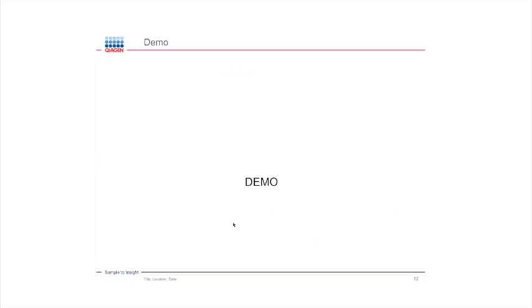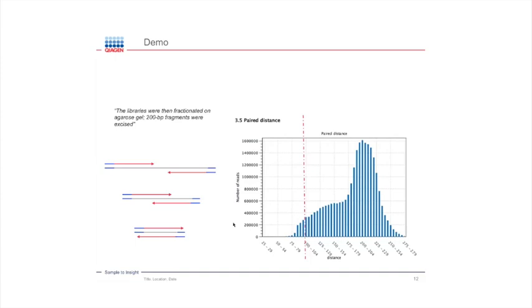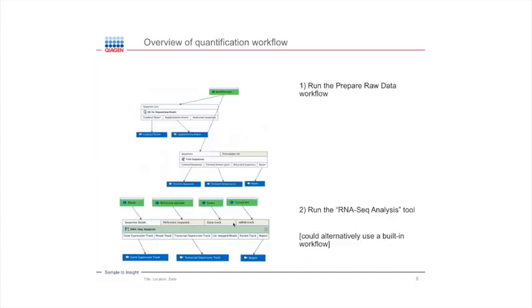So with that said, now we've got to the demo stage, I'll show you how to actually run this workflow, what it looks like, and you'll see the plots being produced and the other things being produced as well. And then I'll go on to how you would run this RNA-Seq analysis, and then to the downstream analysis before coming back in to the presentation to talk about how the statistics is done and how to control for confounding effects.